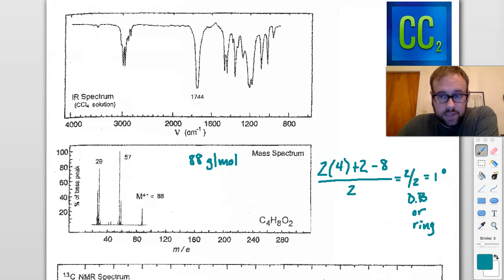And then we have two major peaks that we see going on here. These are very common, a peak at 29 and 57. You'll see that a lot for specific types of functional groups. Now, if you have the guide, you can check your mass spec appendix and check out all the common fragments. 29, so the peak at 29, is almost definitely going to be an ethyl. That's the most common fragment that we see at 29 is a CH3, CH2.